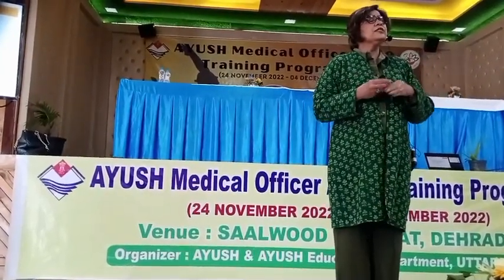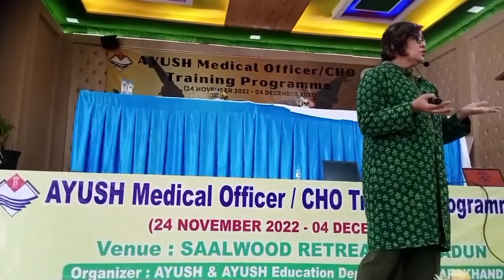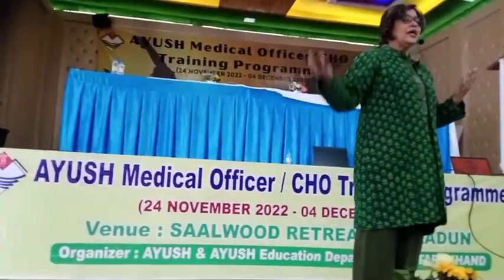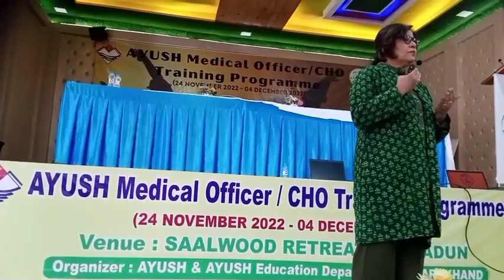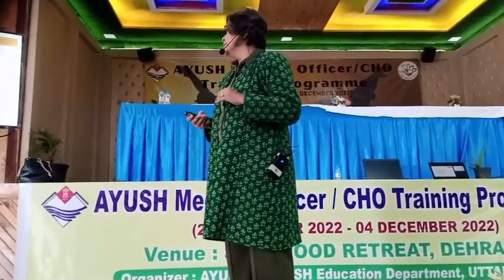Then, of course, now we are required to make sure waste segregation happens. I have just come from Ranikhet. I've been visiting those areas. Everywhere there is waste segregation, which is very nice. The red, yellow, green bins are there, and I think everybody has been trained on this. So segregation of waste, why? Because it is infective. When you put it into the society, you are infecting the society, and you are also part of that society, so it will come back to you. So make sure that you sterilize and throw your infective material through a proper channel.